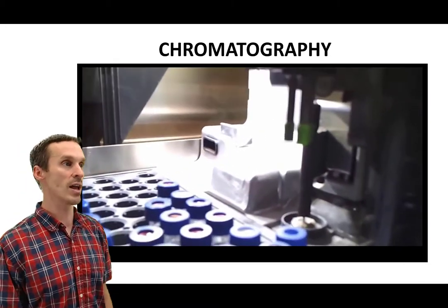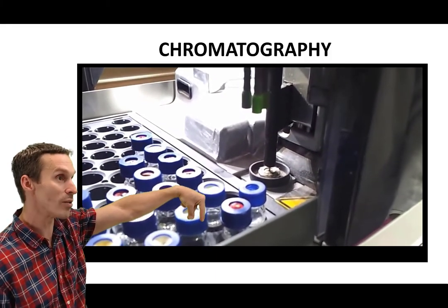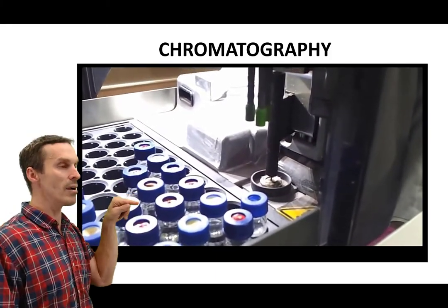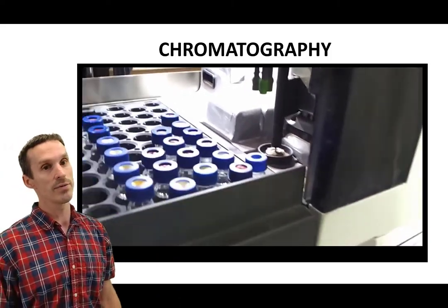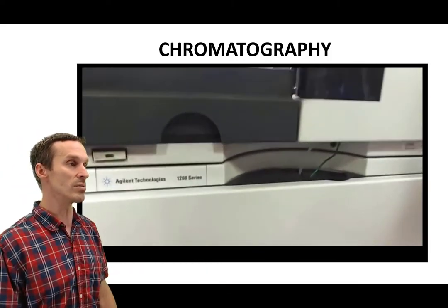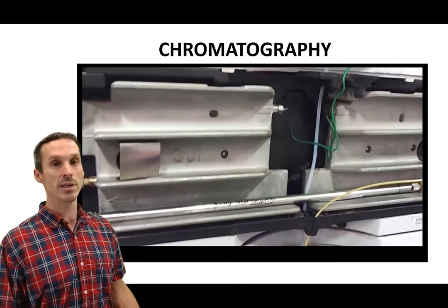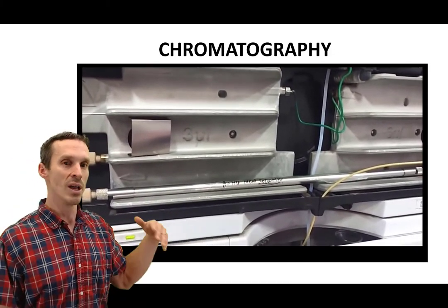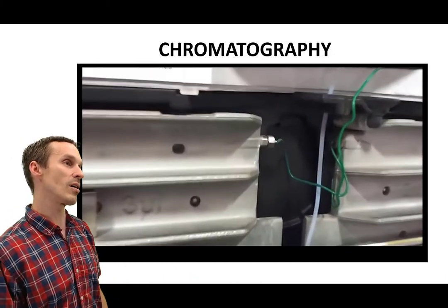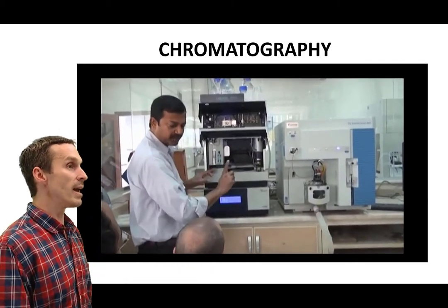That's our autosampler. Each of those vials represents some of our sample, and there's this pincher arm that works its way, grabs one of those vials. You can see a needle in there, so the needle will pierce that red septum and draw up a quantity of sample, maybe five microliters or something like that. Then it works its way down the tube and into the column. In this case, the column is attached to a heater so we can control the temperature. It's not as important as in gas chromatography where we're actually evaporating the molecules, but it's still important.